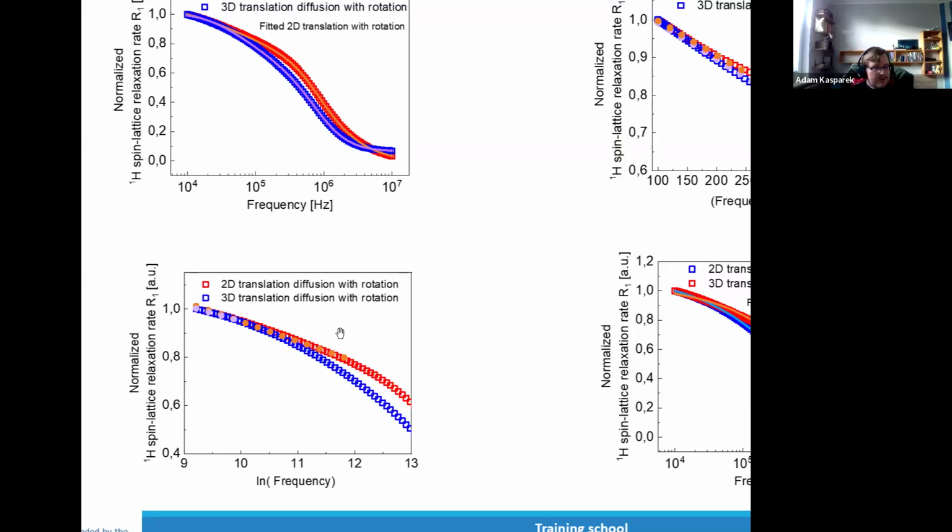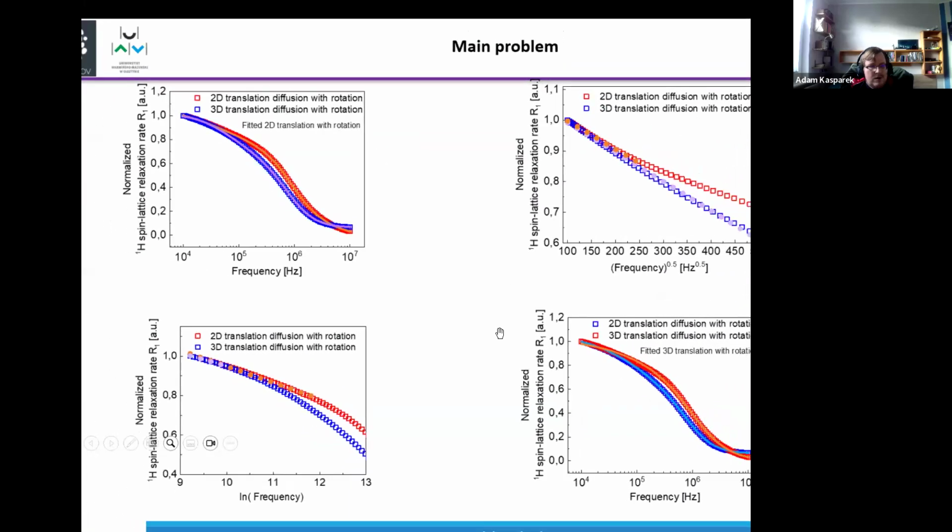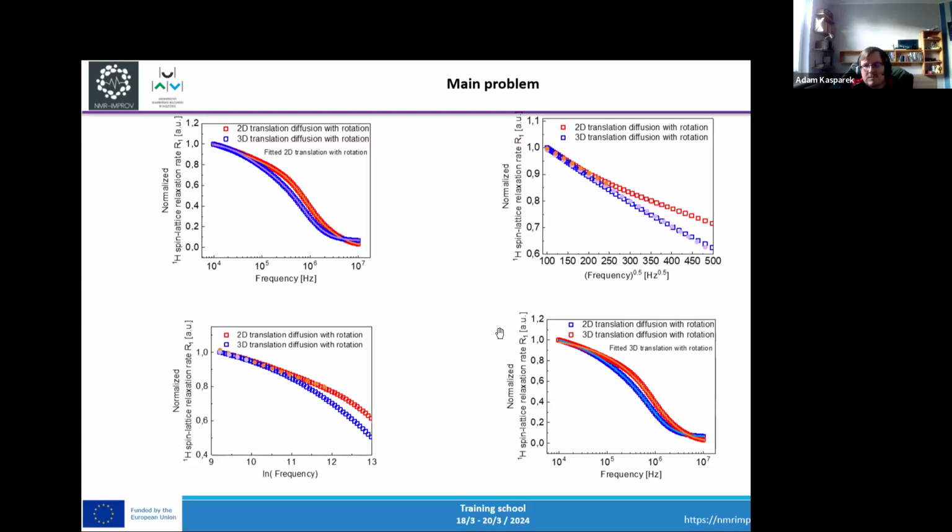So usually when we are trying to fit data, it's always important to remember that very often we don't have to just fit data, see that the model fits, and say everything is good. We have to check whether another model will not fit. What's more, we can check the fingerprints and think rationally.